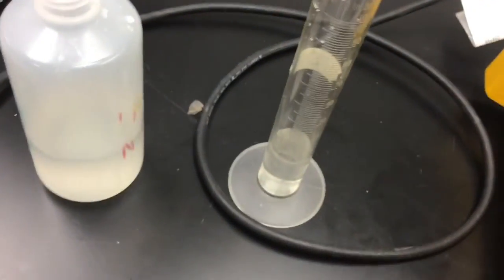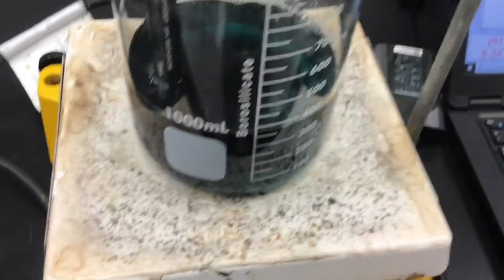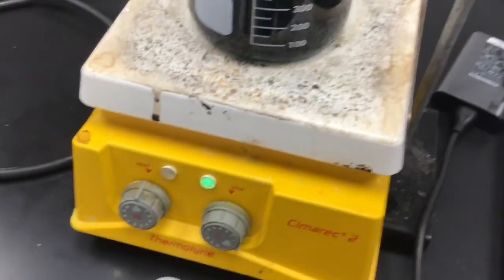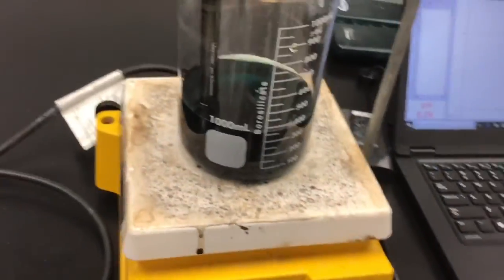So I'm going to add in some universal indicator here, and hopefully we should see a green color when we put this in. There is my universal indicator, and sure enough, I get a nice green color. So I'm fairly satisfied that I'm around a pH of 7 here, maybe a smidge above it.